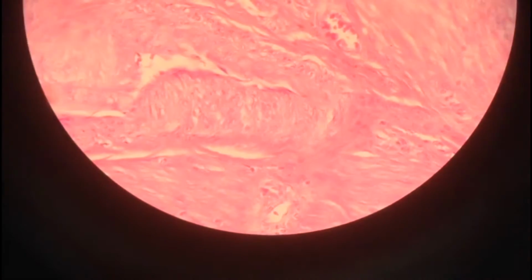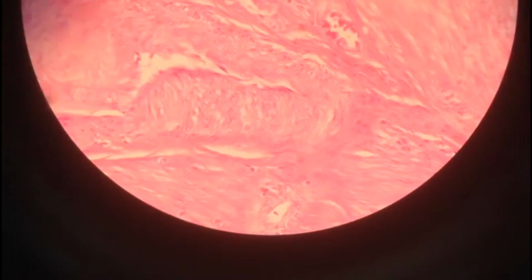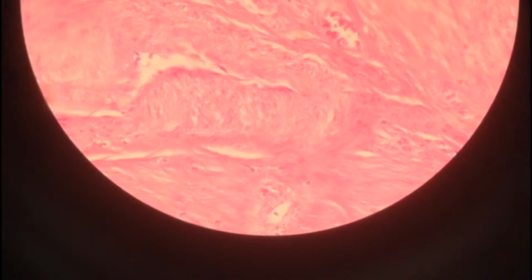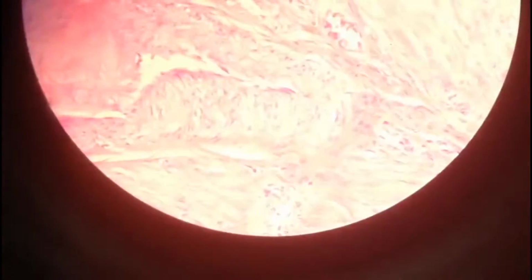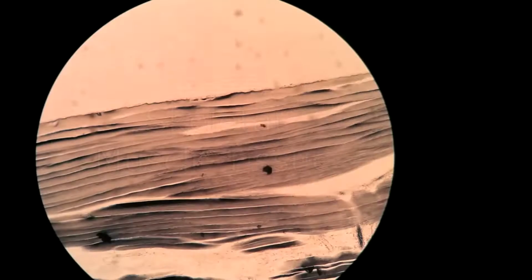Okay, the function of smooth muscle is to constrict the vessels they surround. Smooth muscle also contributes to moving fluid through the body and to the elimination of indigestible matter from the gastrointestinal system. Okay, you can find this type of tissue lining the walls of hollow internal structures such as blood vessels, stomach, intestine, gallbladder, urinary bladder, and airways to the lung.